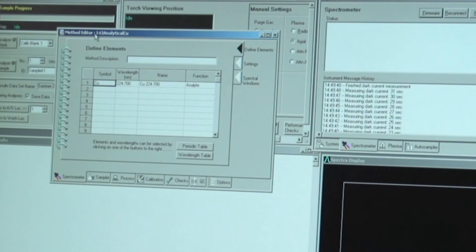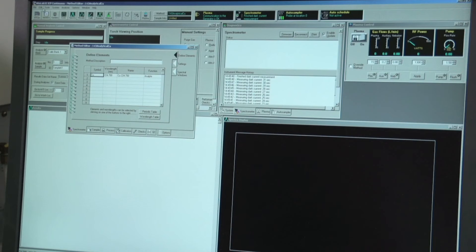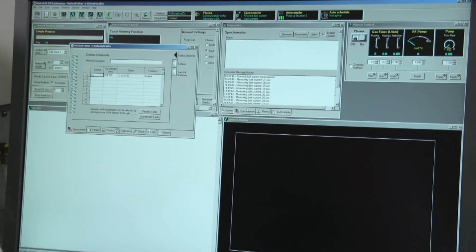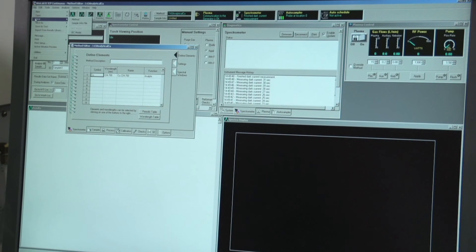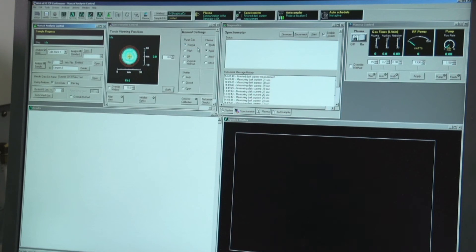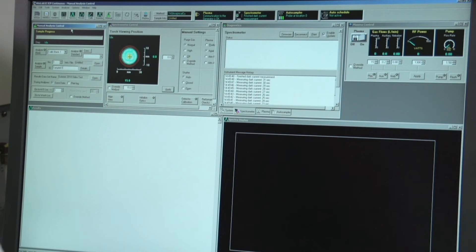Check the method again by going to Edit > Check Method to confirm it is okay. Save the method via File > Save > Method. Before taking the blank sample, flush the line to remove any residual copper solution. Then hit analyze blank. Note that this is the last blank sample you will take for all copper measurements.